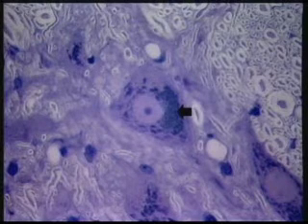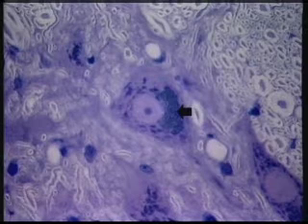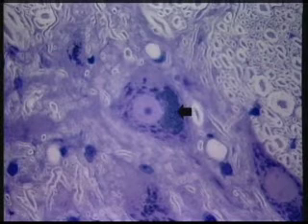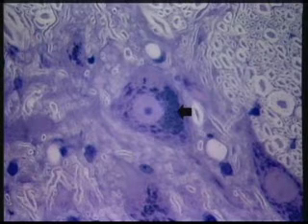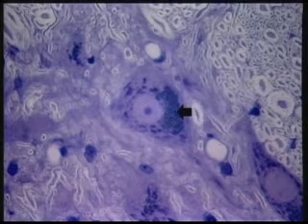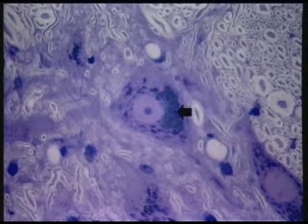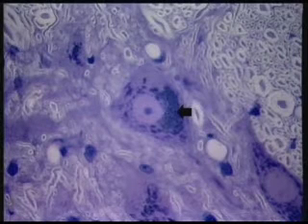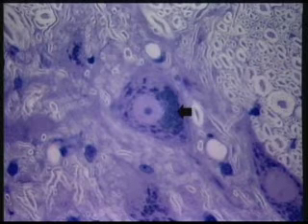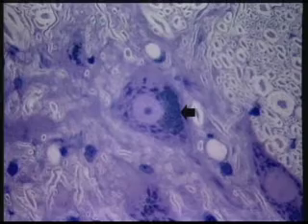These are lysosomes that have ingested something from the outside world and have been unable to completely degrade the materials. So these structures are called lipofuscin granules. They're also called wear and tear granules, and they represent lysosomes that have glommed onto something that they cannot digest. In nerve cells, lipofuscin granules or wear and tear granules tend to build up with age. So the more you see, in general, the older the nerve cell. Lysosomes tend to be too small to see with the light microscope, but when they've combined with something indigestible and formed these large complexes, they're quite readily visible.